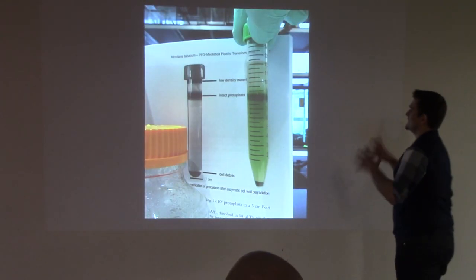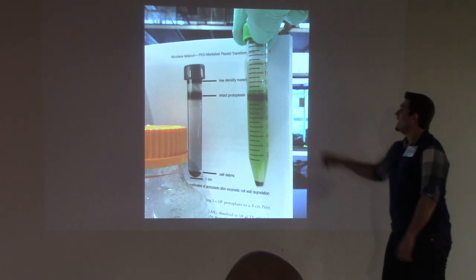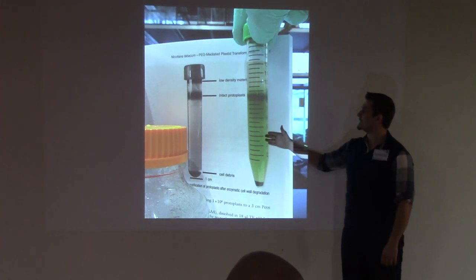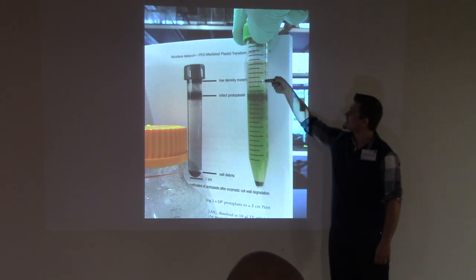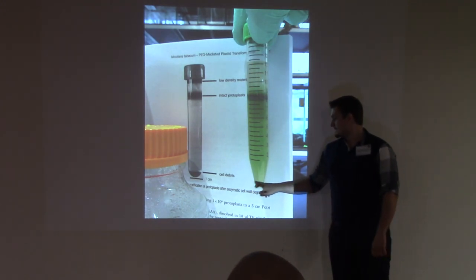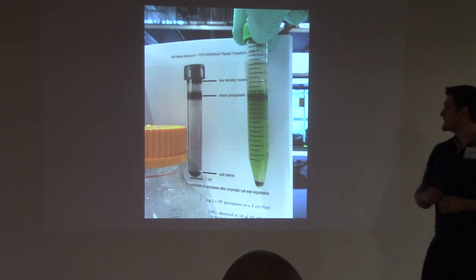So I'm super proud of this. It was so hard to do. I did this like a billion times. I wish that was hyperbole. And so what you have right here, I was so happy that it even lined up perfectly. So here are the intact protoplasts. Here's a bunch of low-density garbage, like vacuoles and broken cell stuff. And here's all the cell graveyard debris, because you were too rough with them in the handle. So they kind of pop a bit.